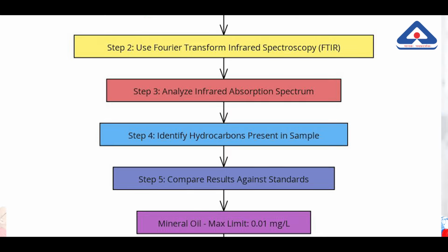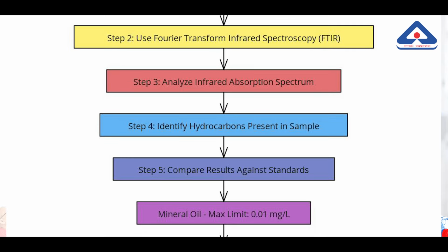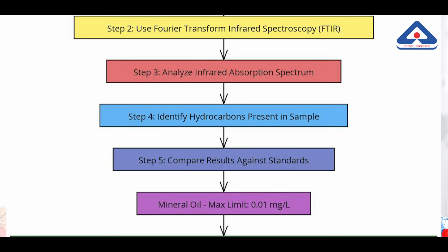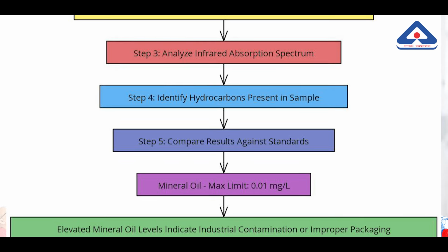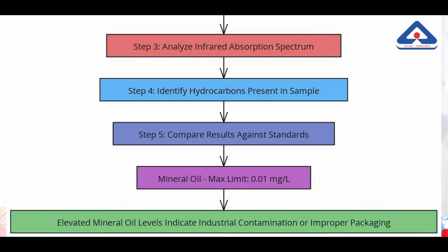The results help identify even trace amounts of mineral oil, ensuring water safety. Elevated levels of mineral oil may indicate contamination from industrial discharges or improper packaging materials.